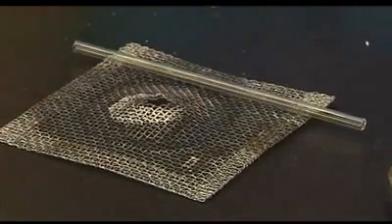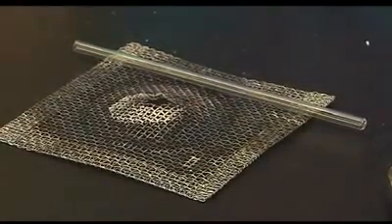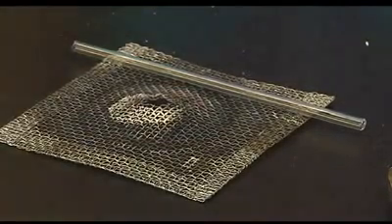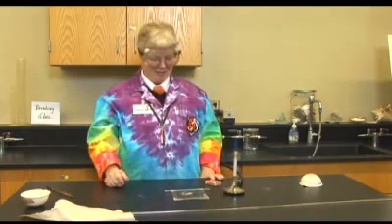Then you will put this down on a piece of wire gauze and wait for it to cool. You will know when it's cool when you put your finger on it and it doesn't burn. Remember, the first aid for a hot finger is to put it under cold water.